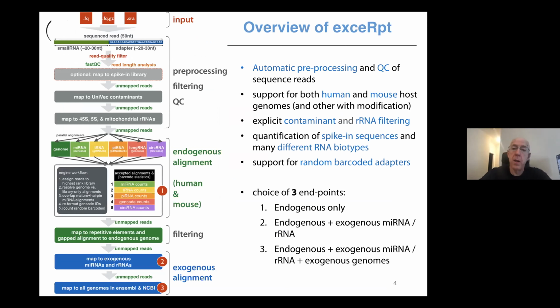So you've seen a version of this slide before from both Rob and Matt. As Rob mentioned earlier, we developed this pipeline specifically for processing extracellular RNA. Because at that time there weren't other comparable standardized pipelines, we adopted a very conservative approach for analyzing extracellular RNA, because we were very worried about potential contamination and potential other sources of RNA, such as DNA and so on.